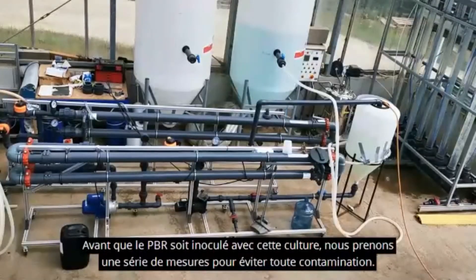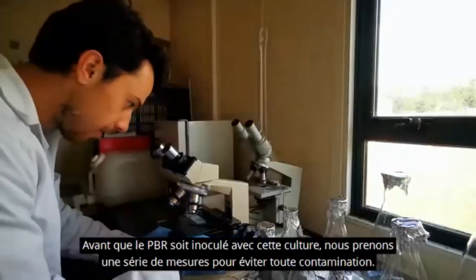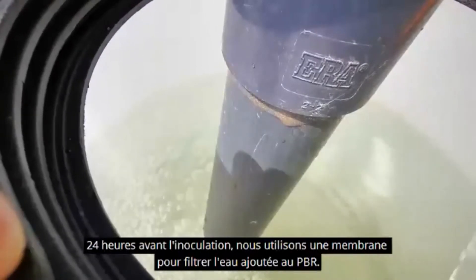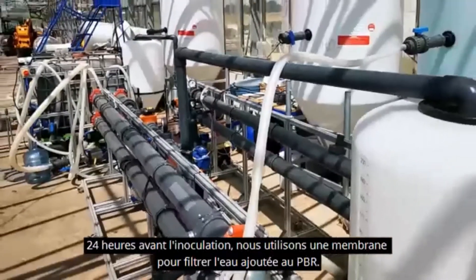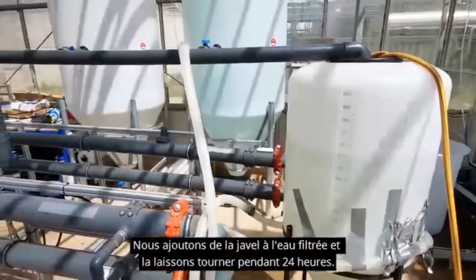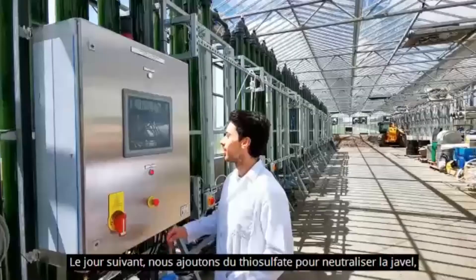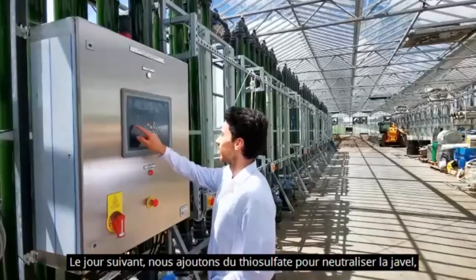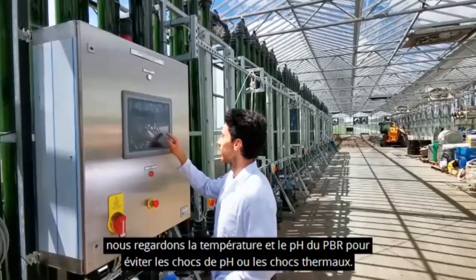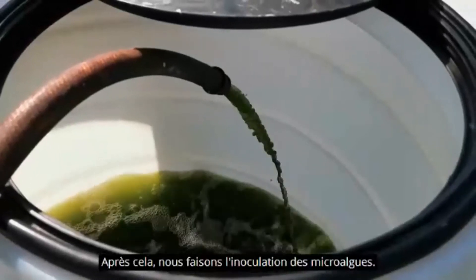But before the PBR inoculation with the culture, we must first take a series of steps to avoid any kind of contamination. 24 hours before the inoculation, we use the membrane to filter the water that is added to the PBR. We add bleach to the water filtered in the PBR and leave it running for 24 hours. The next day, we add thiosulfate to neutralize the bleach. We check the temperature and pH of the PBR to avoid thermal or pH shocks, and after that, we perform the inoculation of the microalgae.